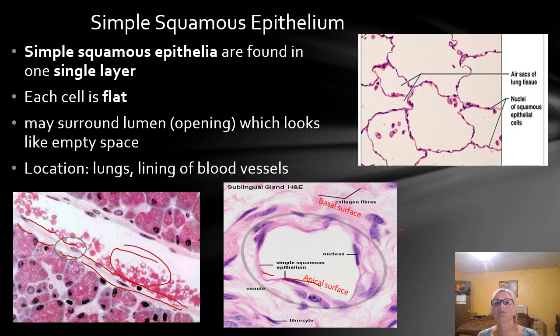All right. So the lumen shows up as a space. When you have a lumen, they're going to be flat and kind of longitudinal or in a circle around a lumen. All right. And we'll look at some more examples of this where they're not surrounding a lumen, where you may have some that are keratinized and they're stacked up and flattened, and we'll get into that.